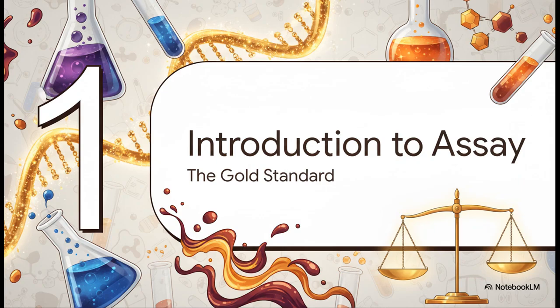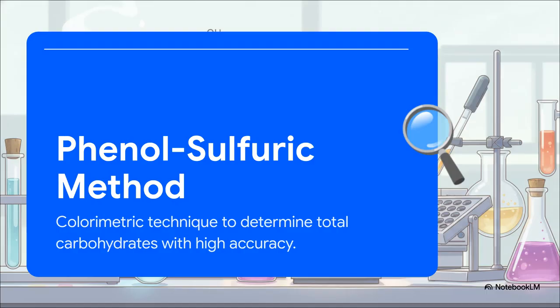All right, Section 1, Introduction to the Assay, the gold standard of sugar quantification. So, let's lay down the foundation. What exactly does this method actually do? Well, the Phenol-Sulfuric Acid Method is honestly a total workhorse in the lab.